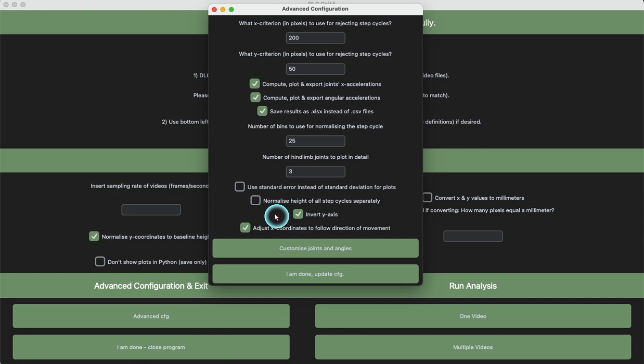So then the nose will have a more positive value with minus 10 compared to the foot, which is then minus 15. And because we normalize heights always in these three ways I just mentioned, we have nice interpretable values after these two steps.